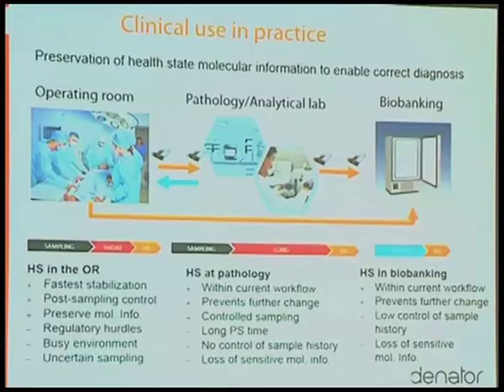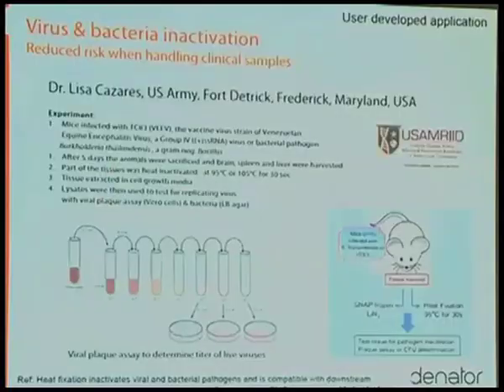We've also done studies taking fresh samples that have between 30 and 45 minutes post-operation time, and even with that time, we see an improvement in the number of phosphorylations that we detected. So it's also possible to have it here, or as it arrives at the biobank, or also here as the biobank sends out the samples to customers. And there are a number of pluses and negatives depending on having it in these various places.